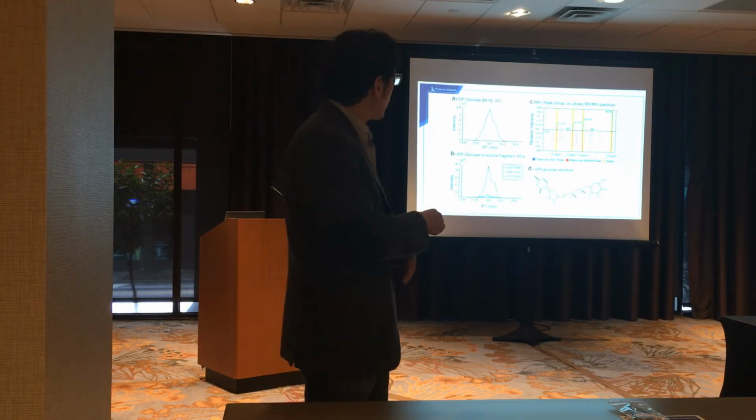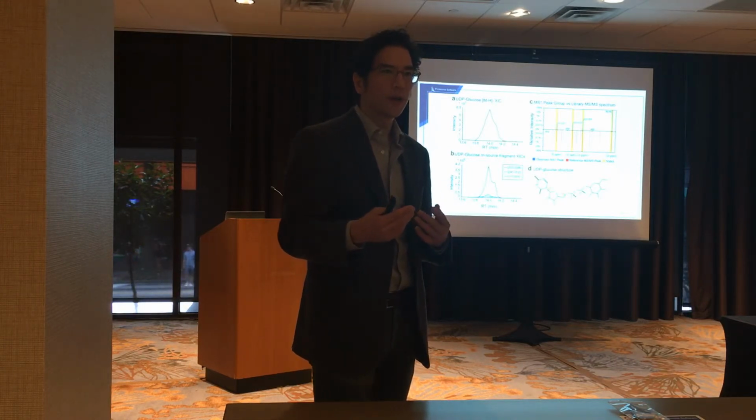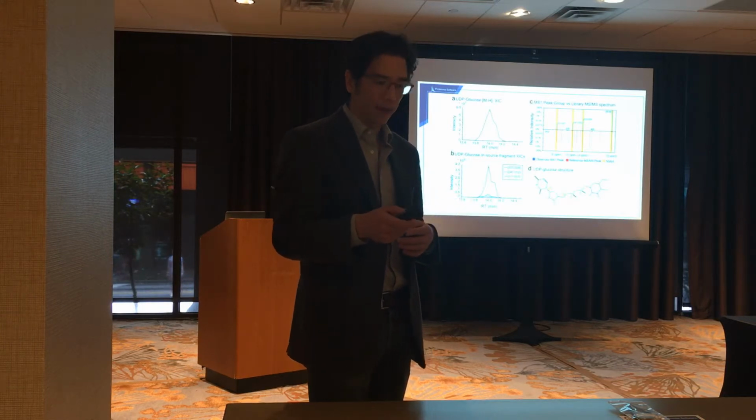metabolite. So all of these ions in yellow here are ones that we identified out of the precursor signal, and then these are the ones in the library. So we're basically doing a library search, but without even needing to collect the MS2s.